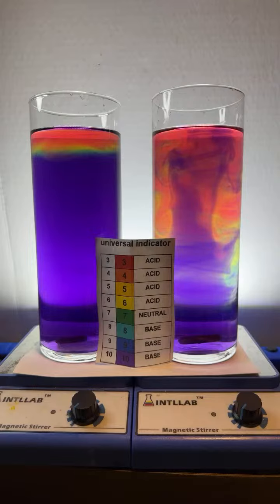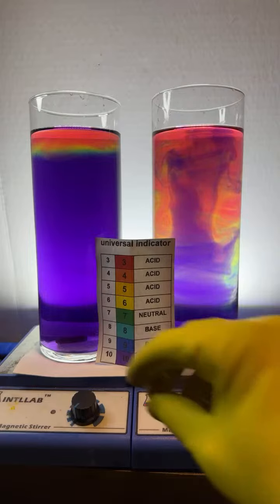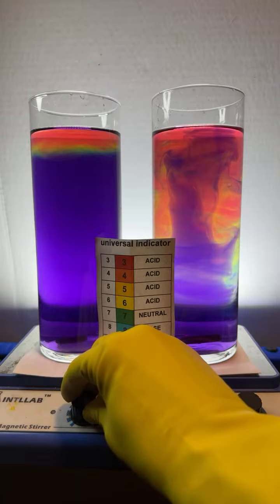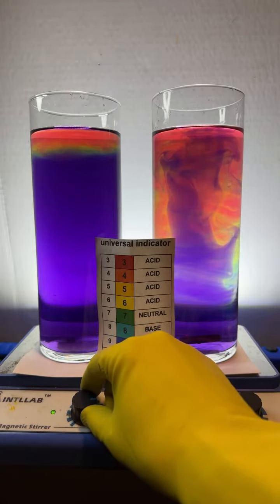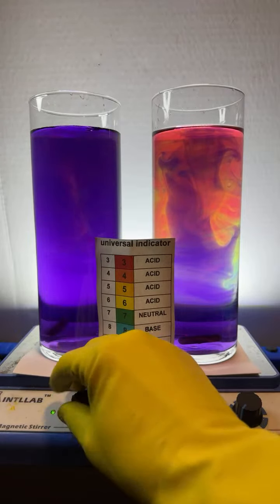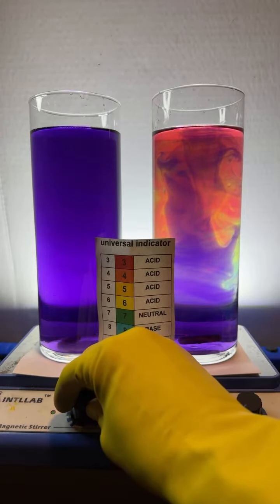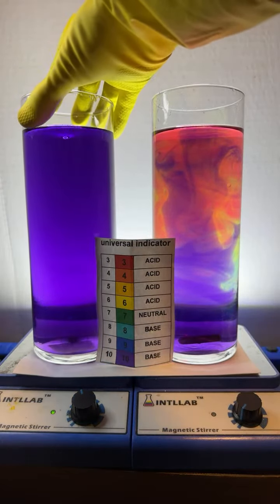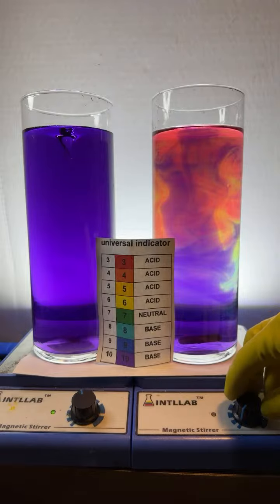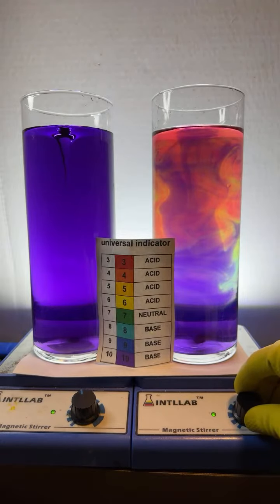Is acid lighter and that's why it's always on top? Well, let's test it. Let's just test it, all right? Here we go. I'm going to mix this one up. Now remember, if there's more acid than base, the color will be reddish. And if there's more base than acid, it will be violet. Looks like I got more base over here, yeah? Let's try this one over here.